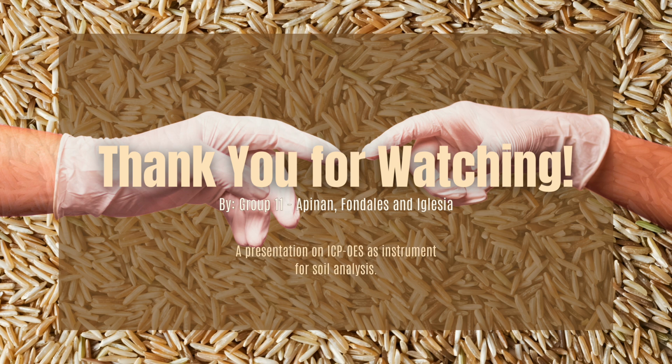Although it requires sample preparation and has significant operational costs, its robustness, precision, and well-established methodology make it a dependable tool for comprehensive soil nutrient profiling. Knowing both its strengths and limitations allows laboratories to make informed decisions about when ICP-OES is the most effective choice for agricultural analysis.